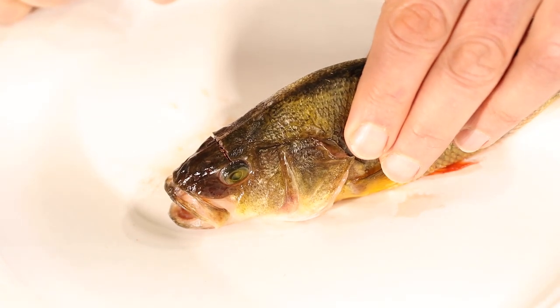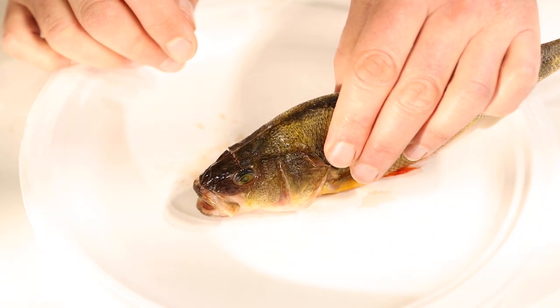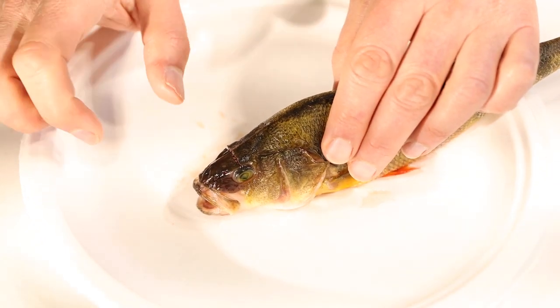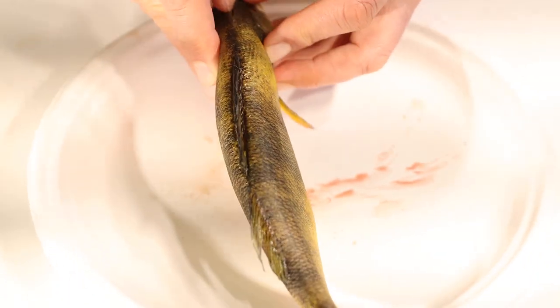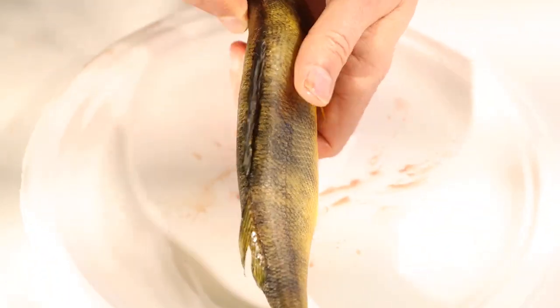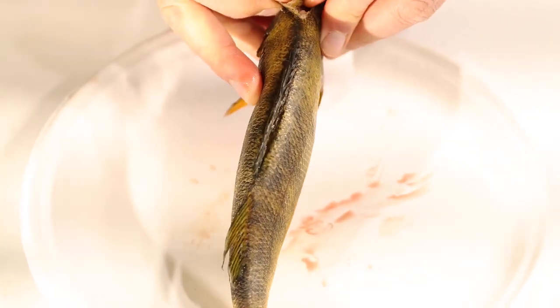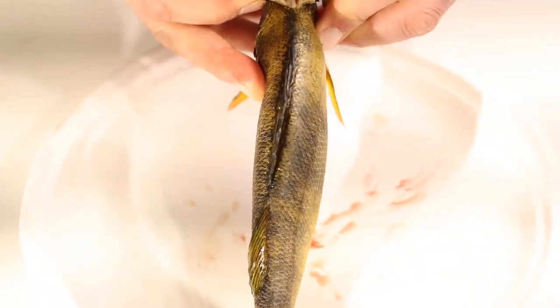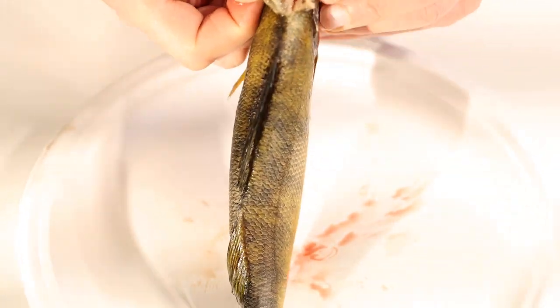Somewhere hidden underneath there, the brain is down inside. It doesn't just pop right open and show us the brain — this is our chance. It's going to take some work and some strong thumbs. We have to try and wedge our thumbs into that first cut that we made and see if we can pry that apart, then pry apart the other side.